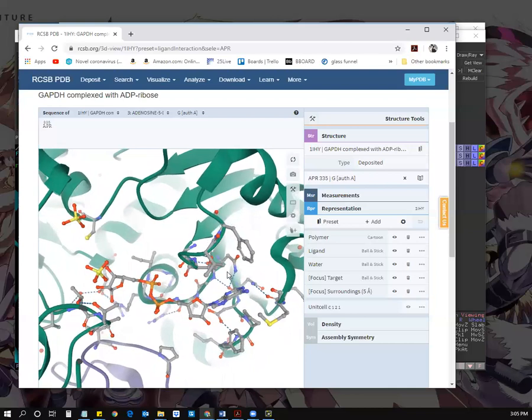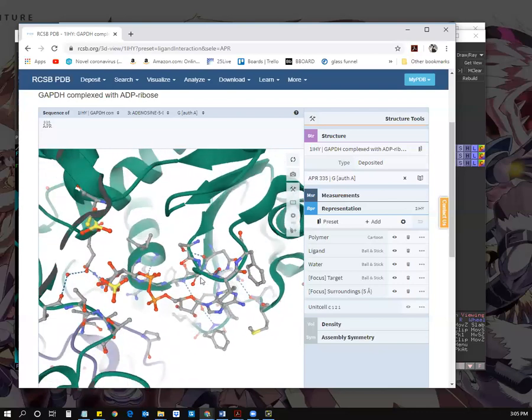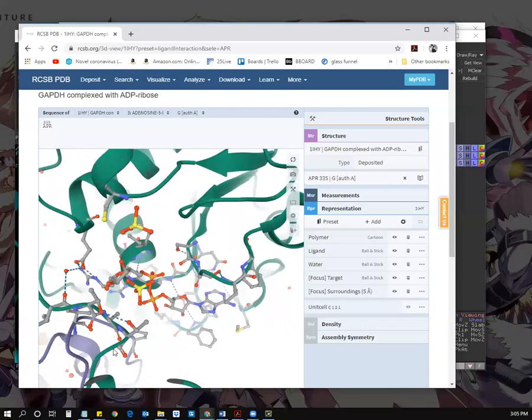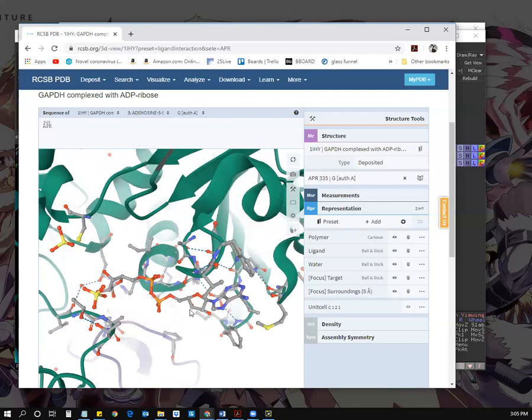But that's not something that we want to look at for this lab, because we want to mutate an amino acid. It doesn't matter what amino acids you choose to mutate, because if you mutate a tyrosine to a phenylalanine, yeah, the R group changes, but that carbonyl and also the amide group in the peptide bonds will not change, because that is just something that does not mutate as you change the R groups in an amino acid in a polypeptide chain.